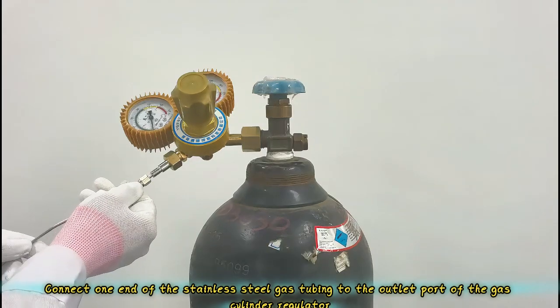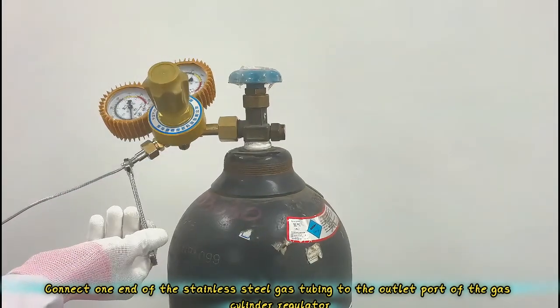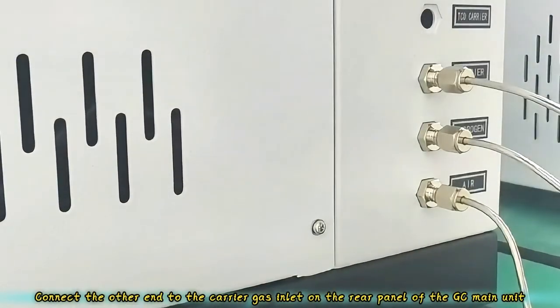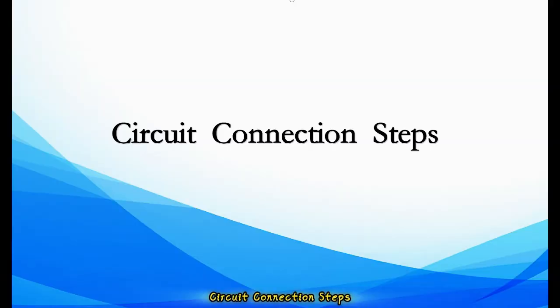Connect one end of the stainless steel gas tubing to the outlet port of the gas cylinder regulator. Connect the other end to the carrier gas inlet on the rear panel of the GC main unit. Circuit connection steps.